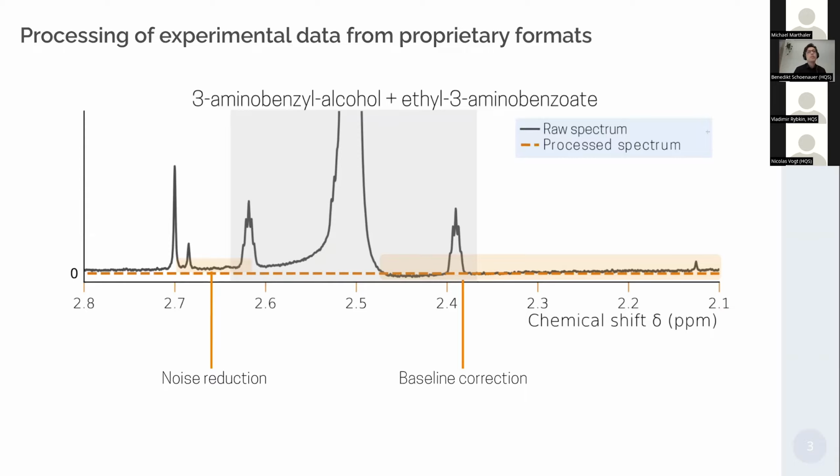So you see a lot of small wiggling, which, if you just look at it, is not very distracting, but of course we're trying to do something automatic, and all of this might interfere with getting the correct spectral weight automatically. So ideally, we want to remove this noise so that it's a smooth function and doesn't suggest some spectral weight where there actually isn't any.